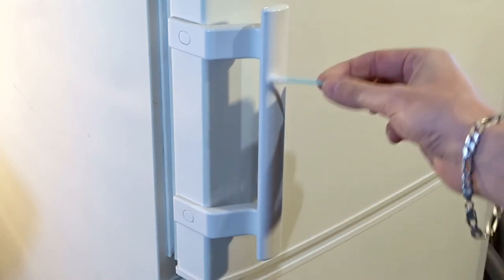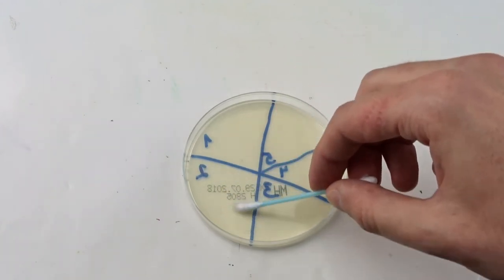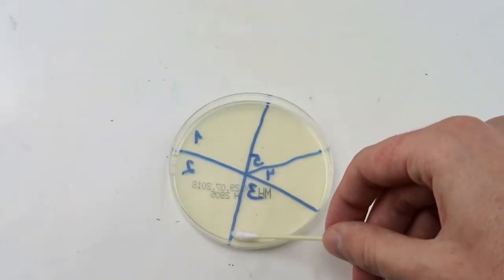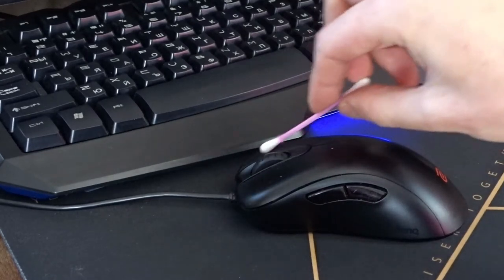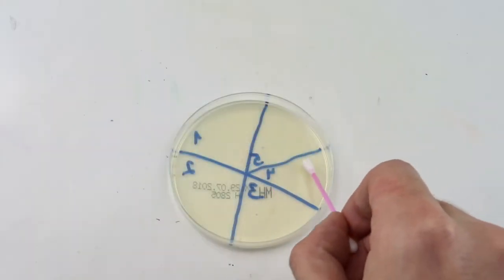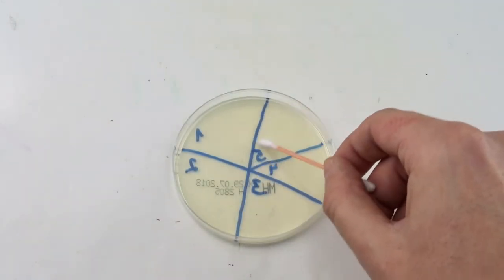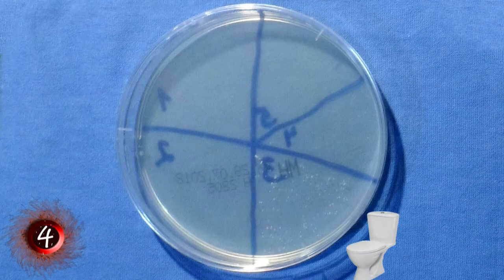The second sample is from the fridge's handle. The third sample is from my toilet. And of course from my computer's mouse. And the last sample is from my phone. So now let's see how they will grow up.